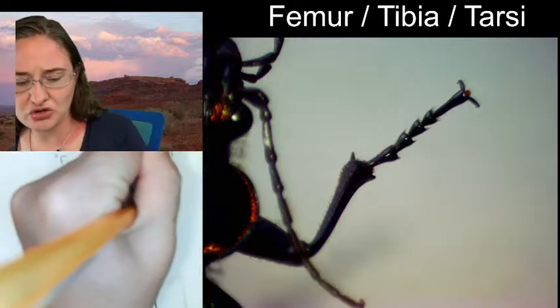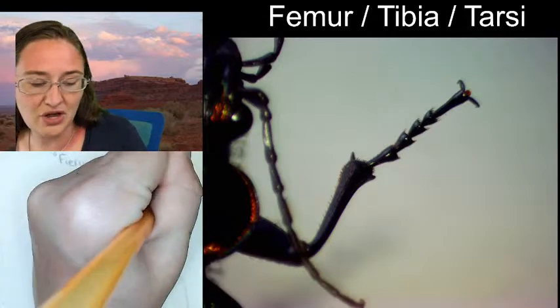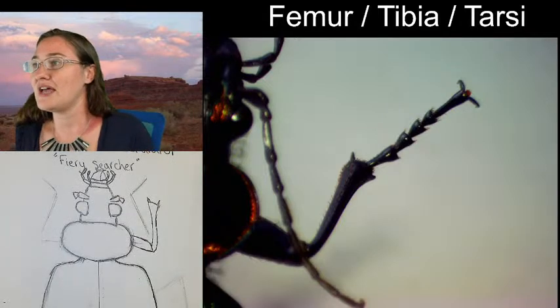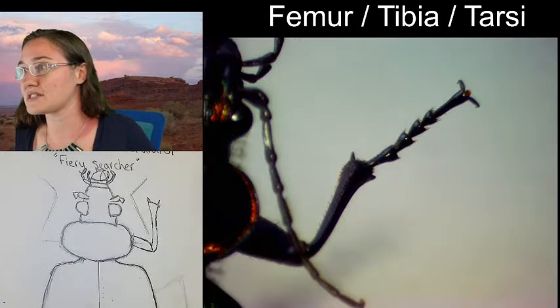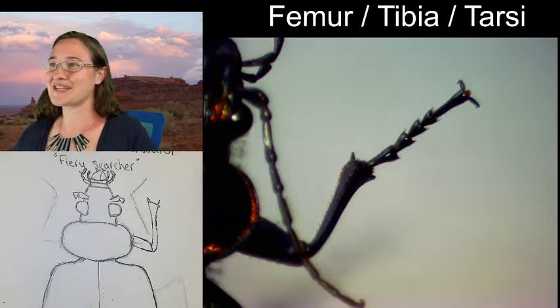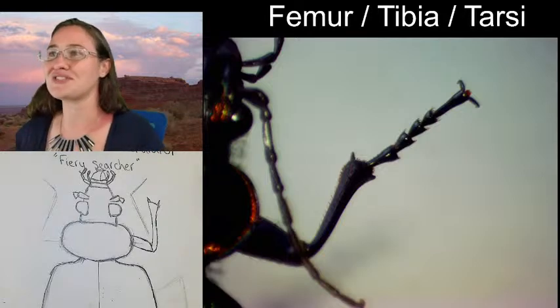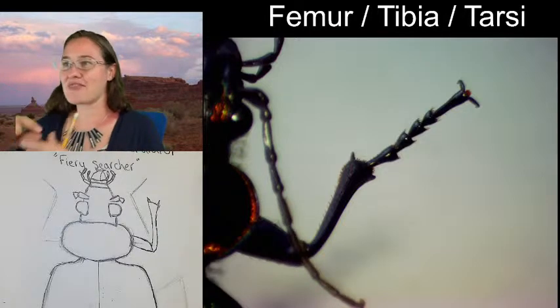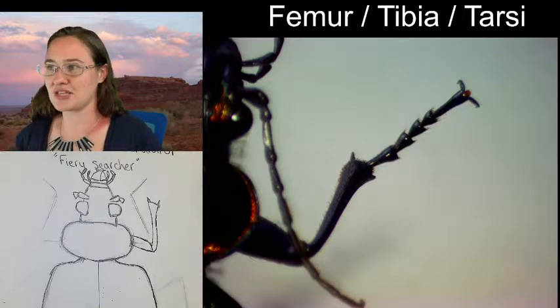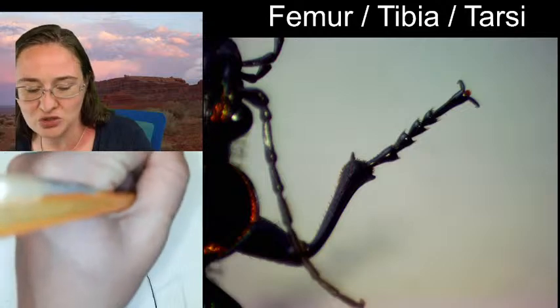All right, so you can go ahead, because we are sketching at this angle, right? You can go ahead and give it almost like two little tibial spurs on either side, and then 5 tarsal segments. I imagine that somebody has taken the conical ice cream cones and strung them together and then opened them up a little bit. That's how I imagine sketching these tarsal segments, because you can see they're like triangles that fit into one another.